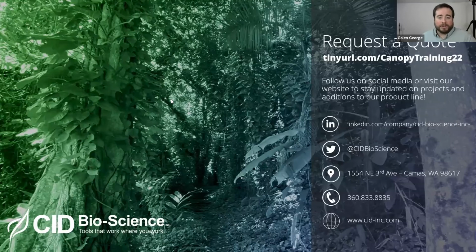With the PAR measurements and with light sensor based technology, you have to make sure you're getting, on that same day, an accurate representation of the light conditions. So you either have to have a separate sensor at all times logging that data in a separate field that is at least close enough by to have relatively the same lighting conditions. That can get pretty messy. And also those instruments tend to be multi-hand operations. With this instrument, it's all in one.